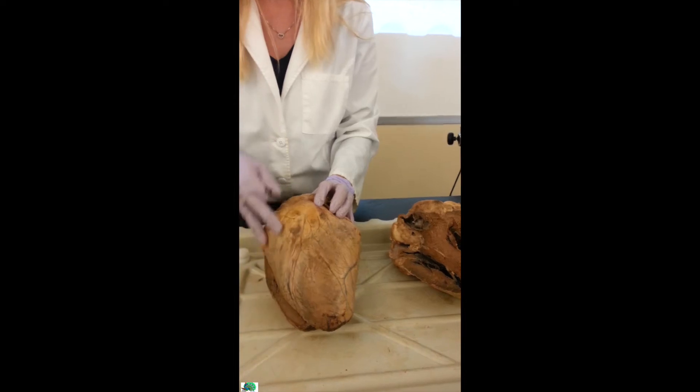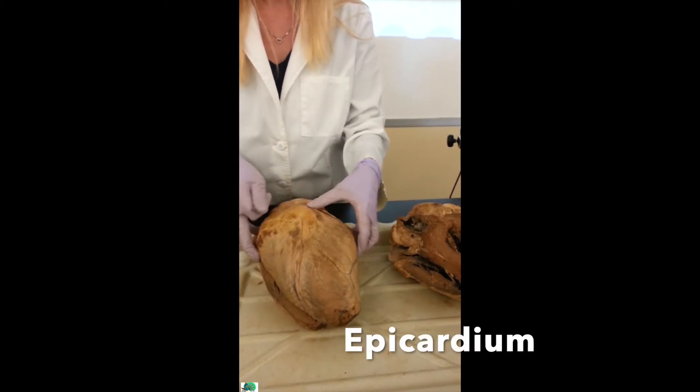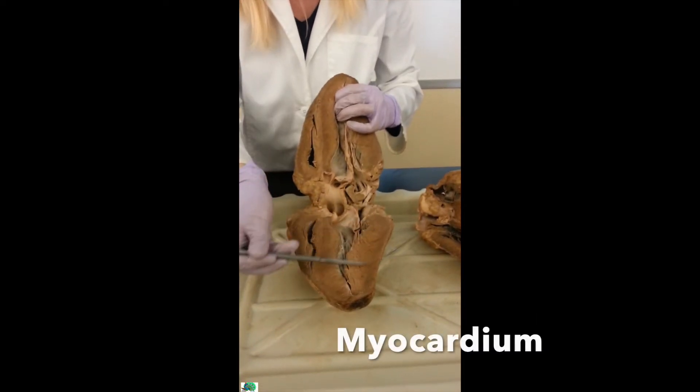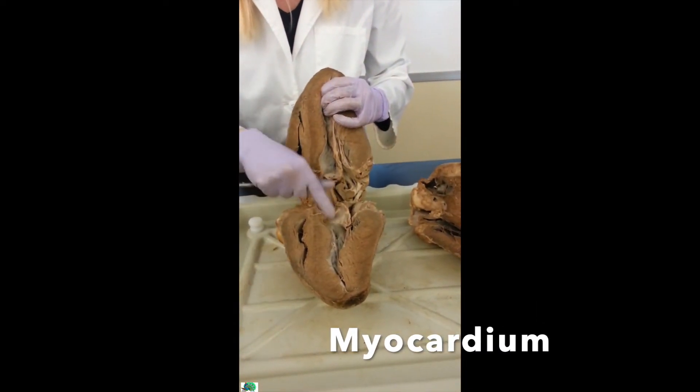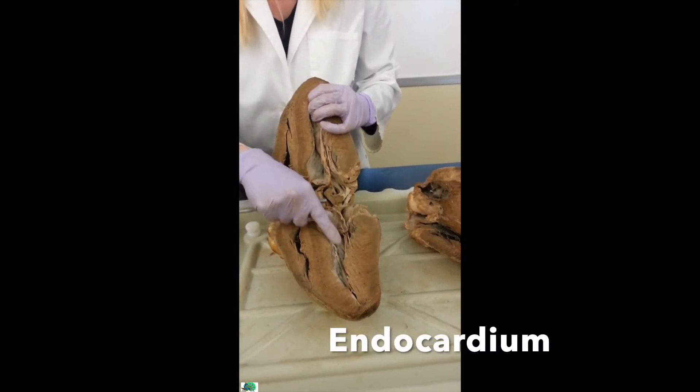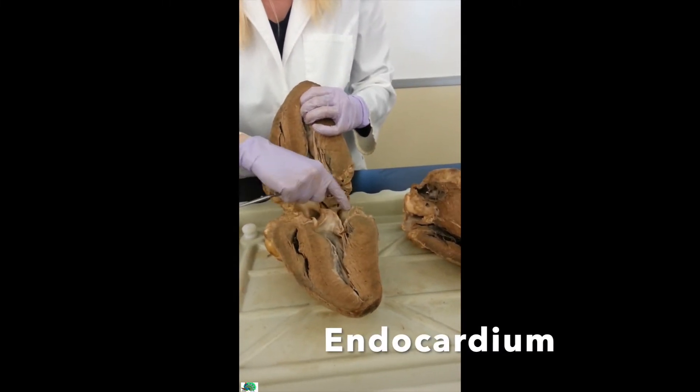All the shiny that you see is the epicardium. If I open it up, the muscle is the myocardium — all that muscle. And then the lining, the shiny that you see on the inside, is the endocardium. It maintains a nice, smooth flow.